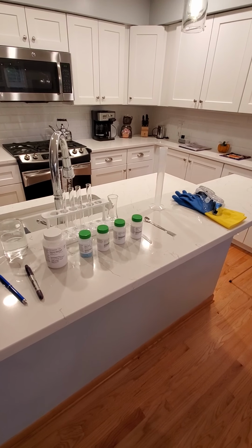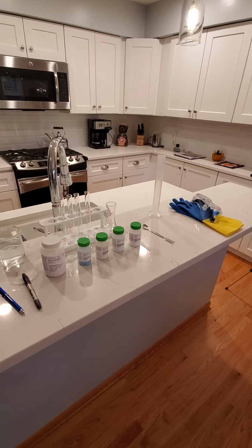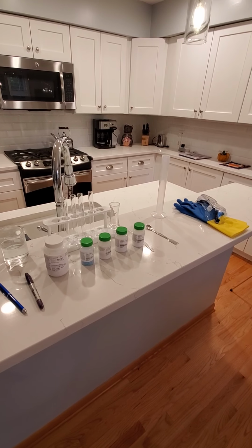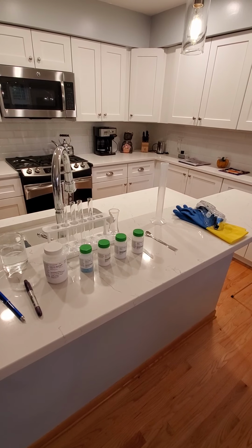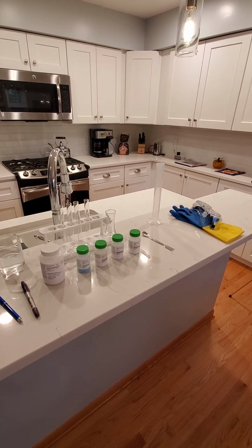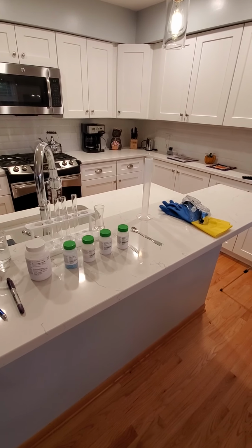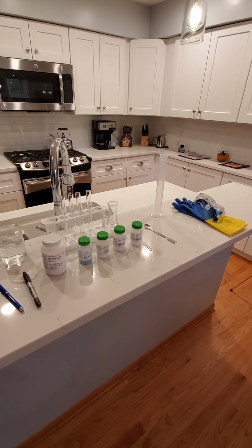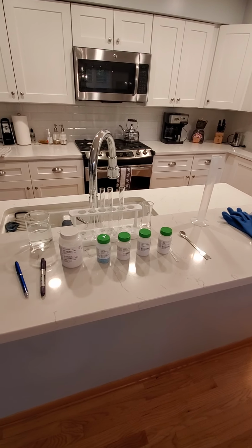The second half I will demonstrate for you, so you will not have to do that part, and we will talk about that in class. You will use the data that you see in this video for the second half, the quantitative, and then I will show you the basics for the first part, which is the qualitative measurement of solubility, which you'll recognize when you read the lab.